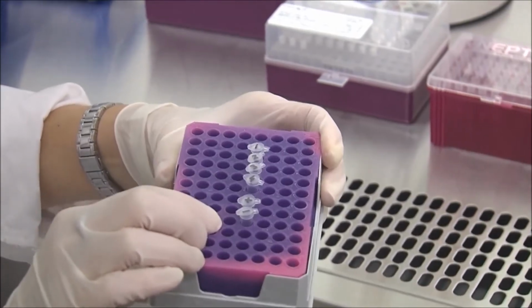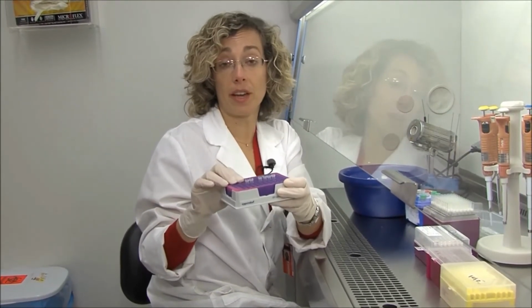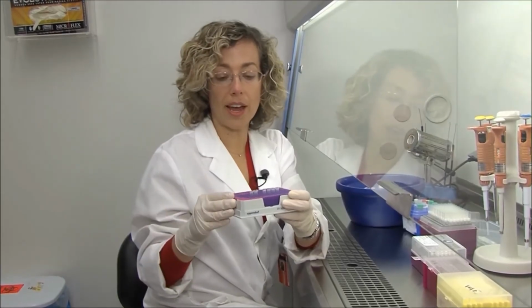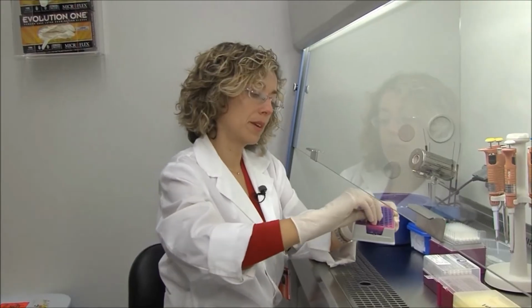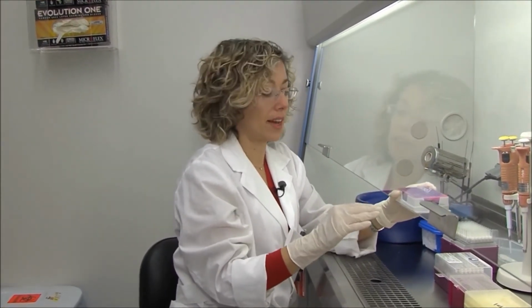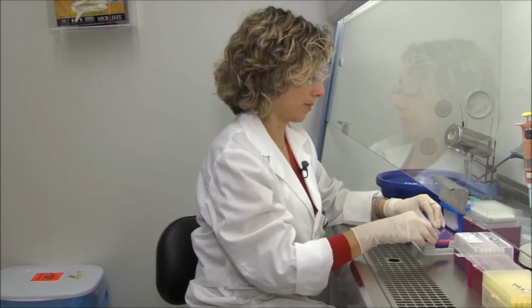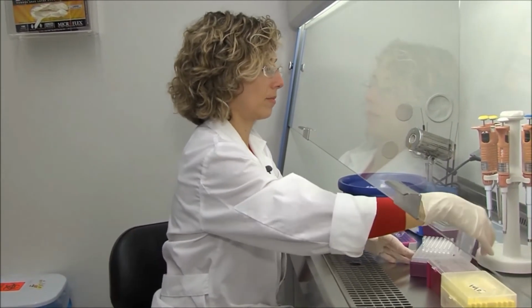The negative control tube is going to tell you if you have any contamination in your disposables or in your hood or in your hands. So what I like to do is leave that tube open while I'm preparing my aliquots to make sure that if there is any contamination around in this area, I will pick it up in my negative control. Ok, sau khi chúng ta pha master mix thì chúng ta sẽ aliquot vào từng cái tuýp 0.2.